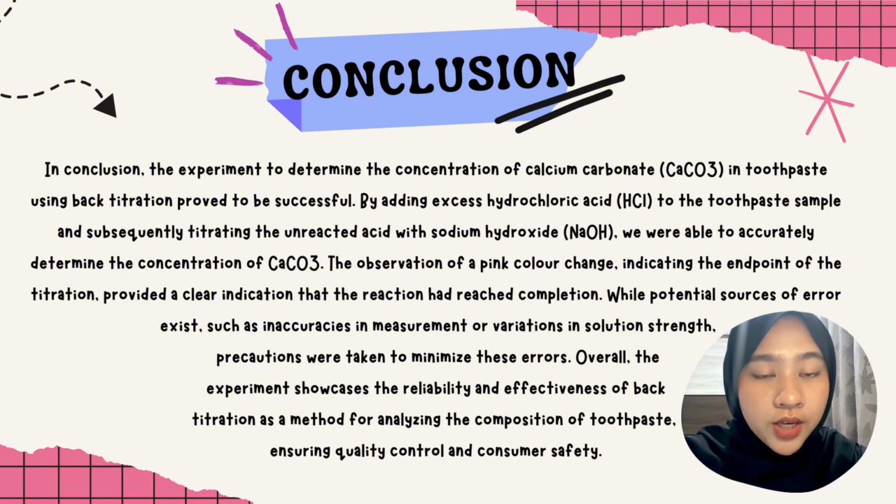Overall, the experiment showcases the reliability and effectiveness of back titration as a method for analyzing the composition of toothpaste, ensuring quality control and consumer safety.